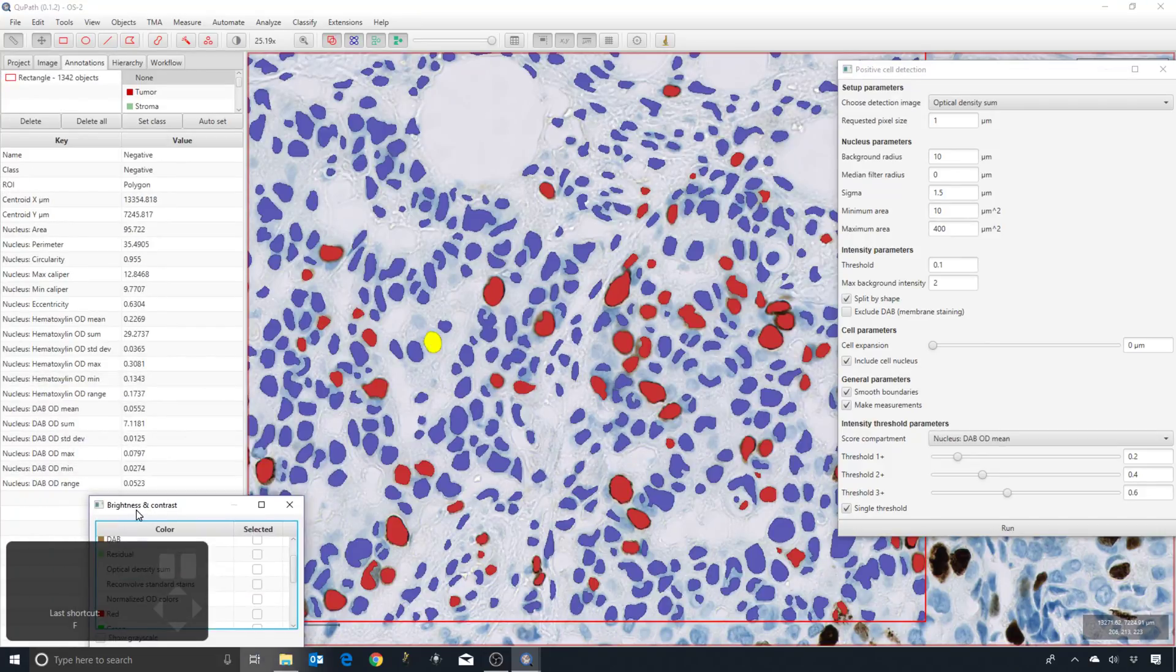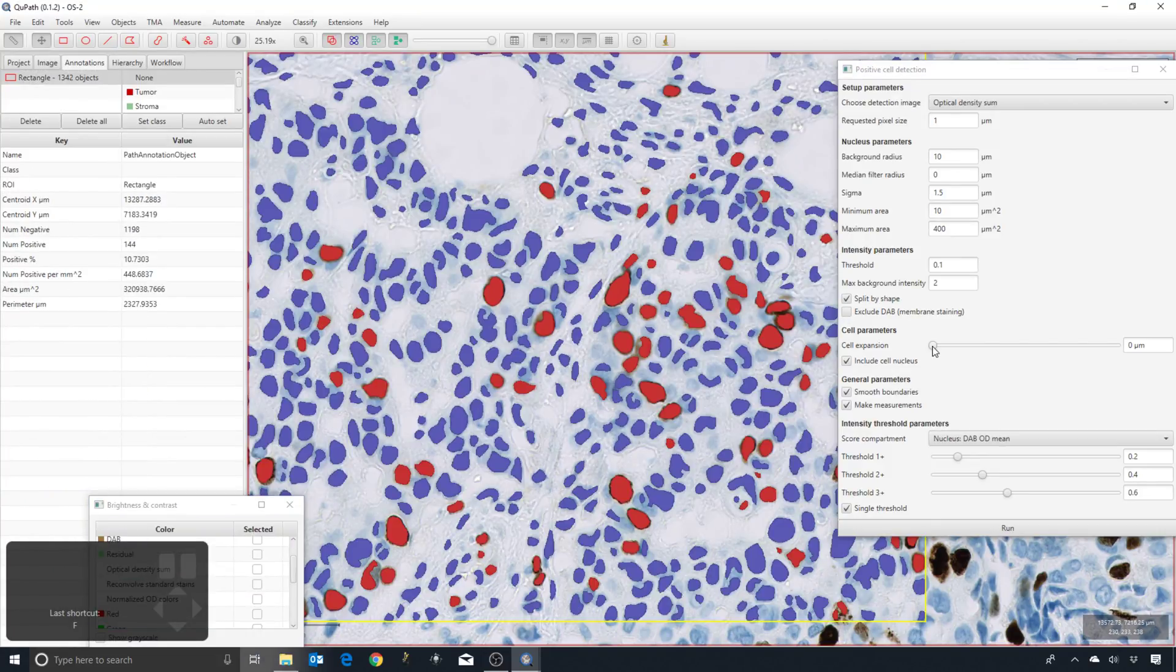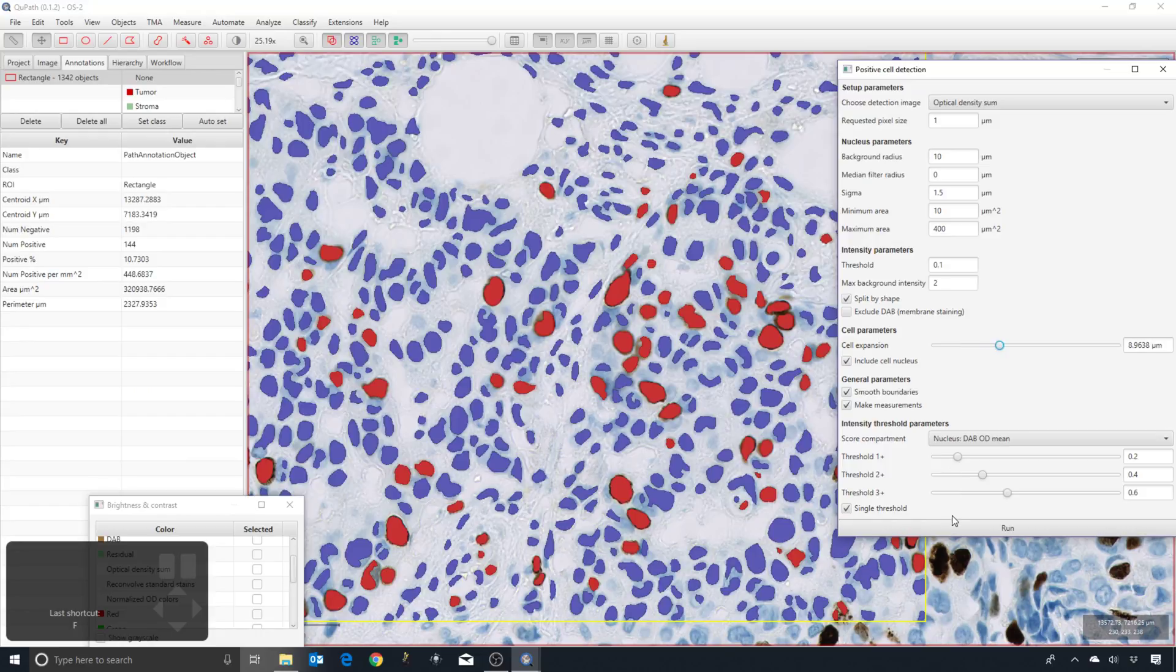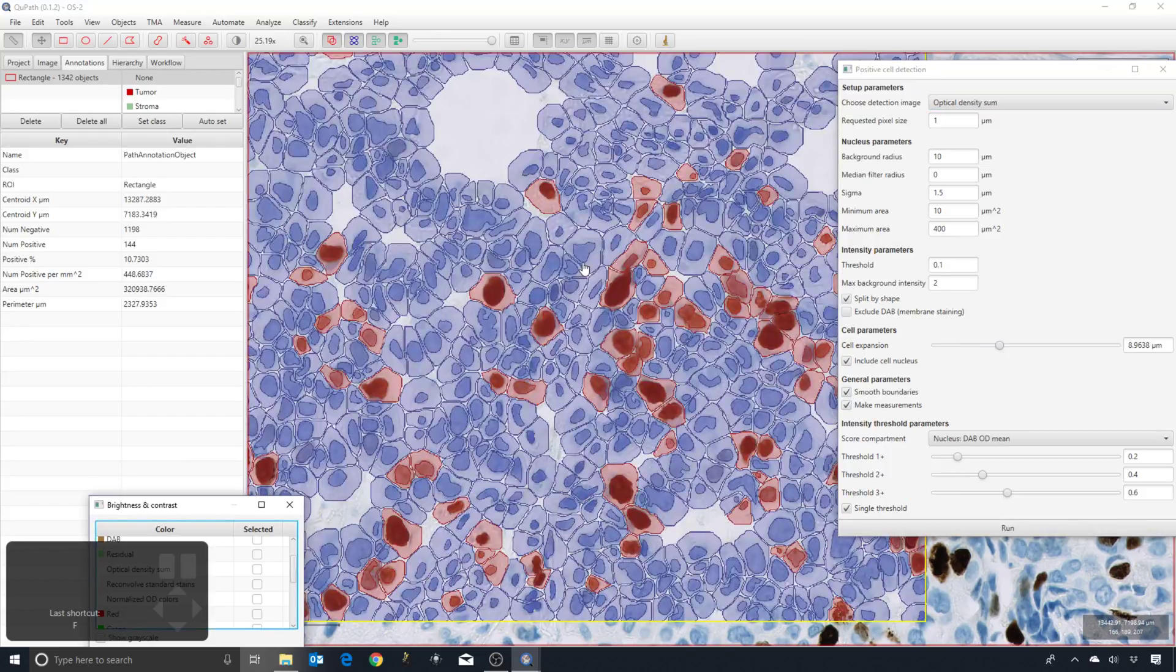For each cell we've got fewer measurements because we only have the nucleus. I can also increase it and then the cell expansion will go much further.